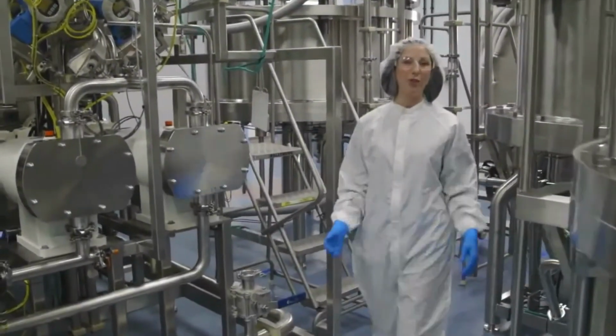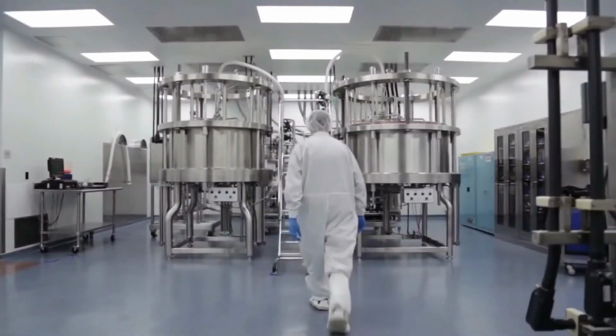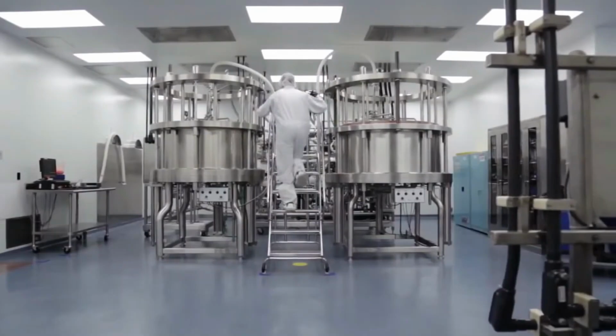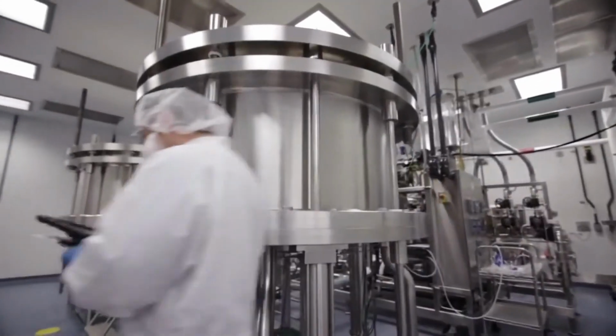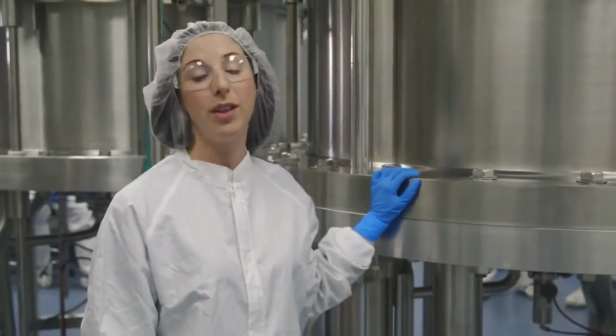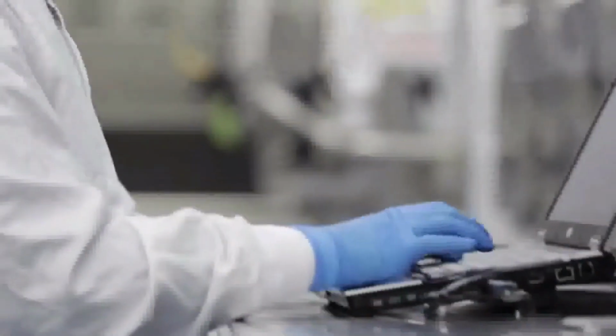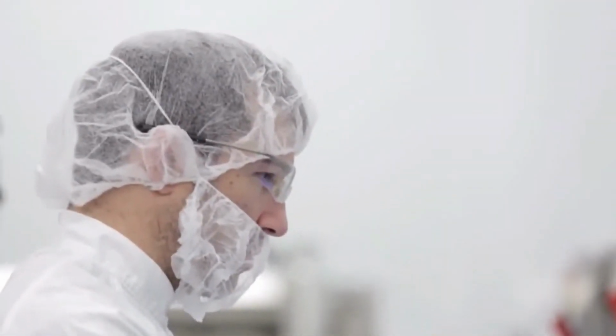Hi, I'm Tracy, and welcome to purification. At this point in the process, the cells have produced all of the protein that they're going to, so we've separated them from the solution containing the protein. Now we're going to take that solution and purify it down to the protein that's specific to our medicine. This equipment is used to perform liquid chromatography, just one of the many steps that we use to purify the solutions containing our medicines. After that, we collect our protein again to perform our next unit operation.